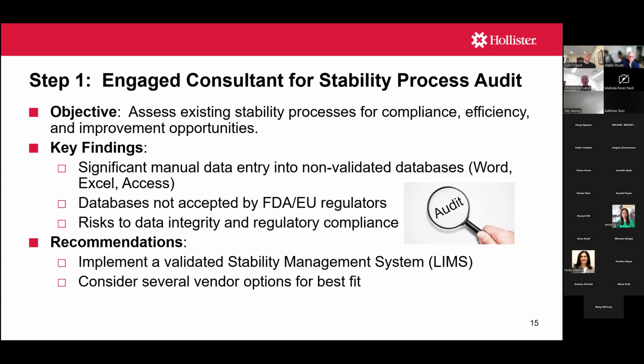So first and foremost, we hired an external consultant just for the purposes of auditing our existing, manual stability process. Many times at companies, you can talk to senior leadership and make recommendations, but many times it carries more weight if it comes from an external consultant. So that was kind of the strategy behind this. So we did engage an external consultant. He spent 2 days on site monitoring all these manual processes that I just talked about.